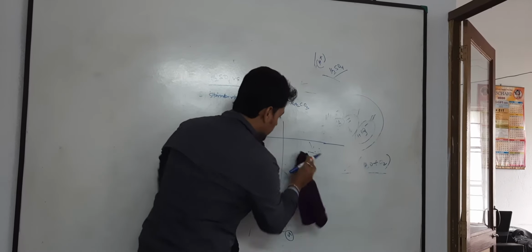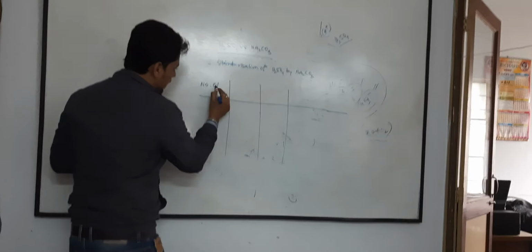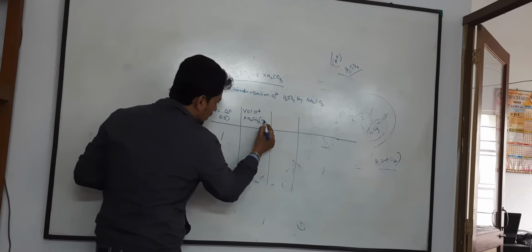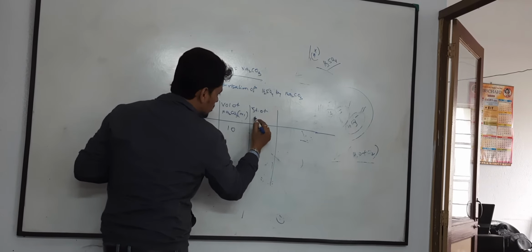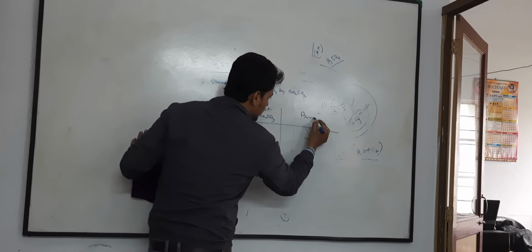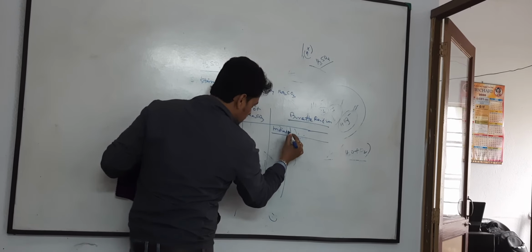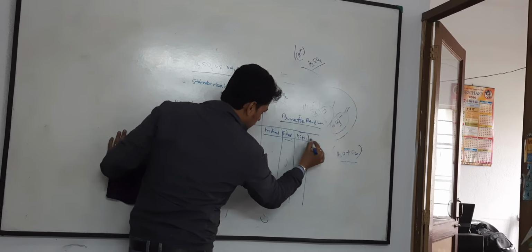When you draw the titration table, you already know that first you need to put the known data. At the very end, I am writing number of observations. We have taken 2 observations. Volume of Na2CO3, I have taken 10 ml both, and strength of Na2CO3 is N by 10. Now burette reading: initial, final, difference, and then average.